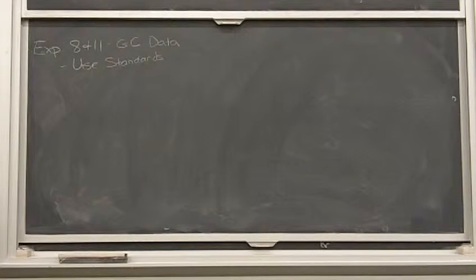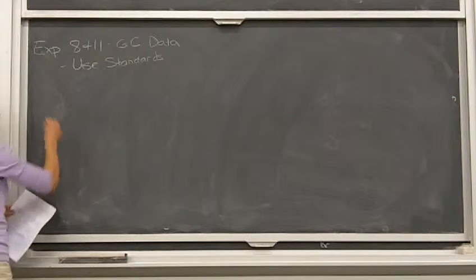And then be careful in looking for them. You want a liquid or neat sample. You do not want a vapor phase IR spectrum because that will look different than what you collected in lab, all right? So those are a couple cautionary notes for experiment 8 and 11.